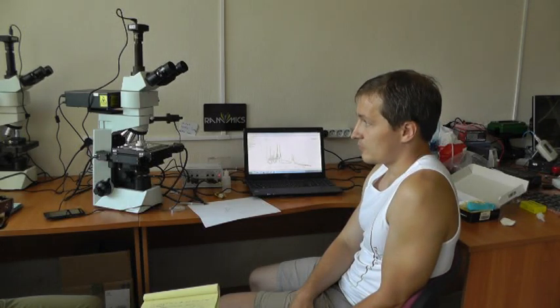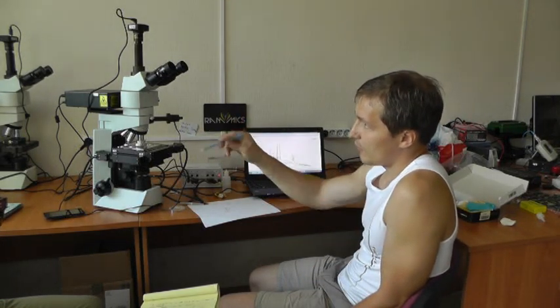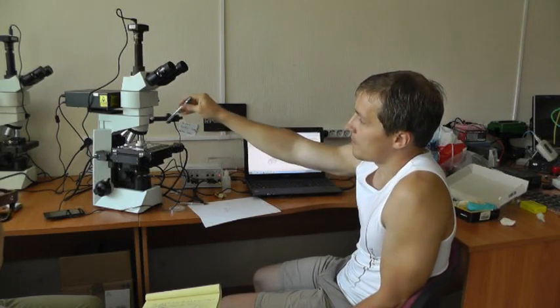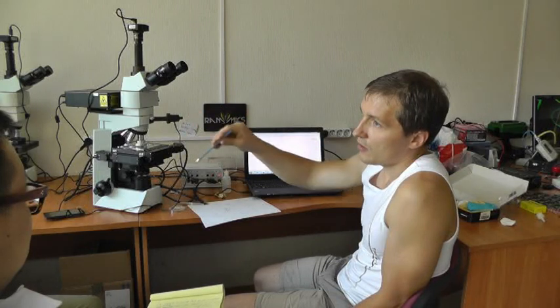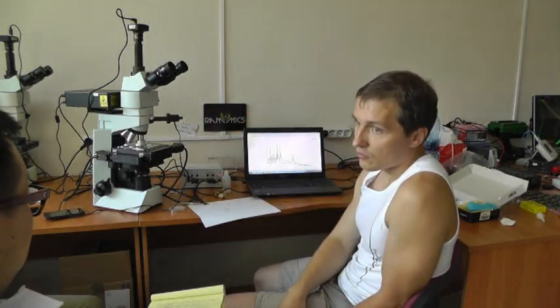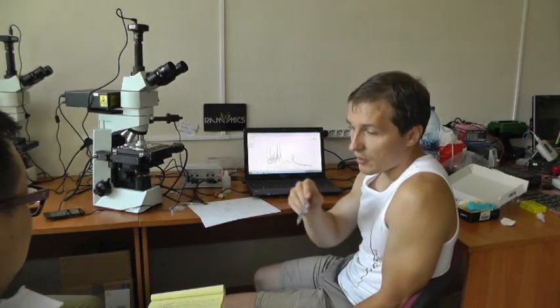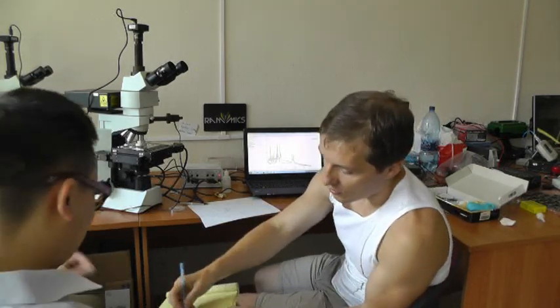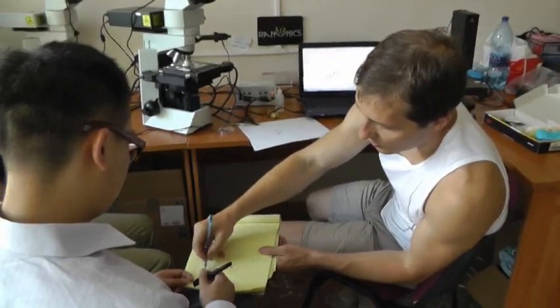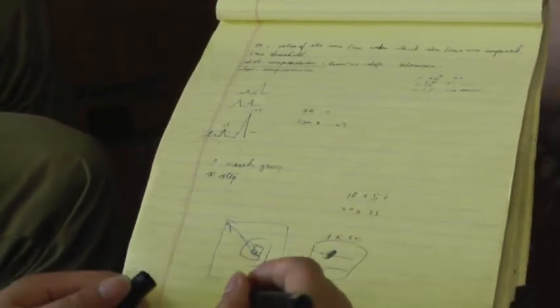And if you are interested in the details, the start position of scanning is located in the center of the scanning square. And before the program starts scanning this square area, it moves from the central point, which was chosen in the beginning, to the corner.